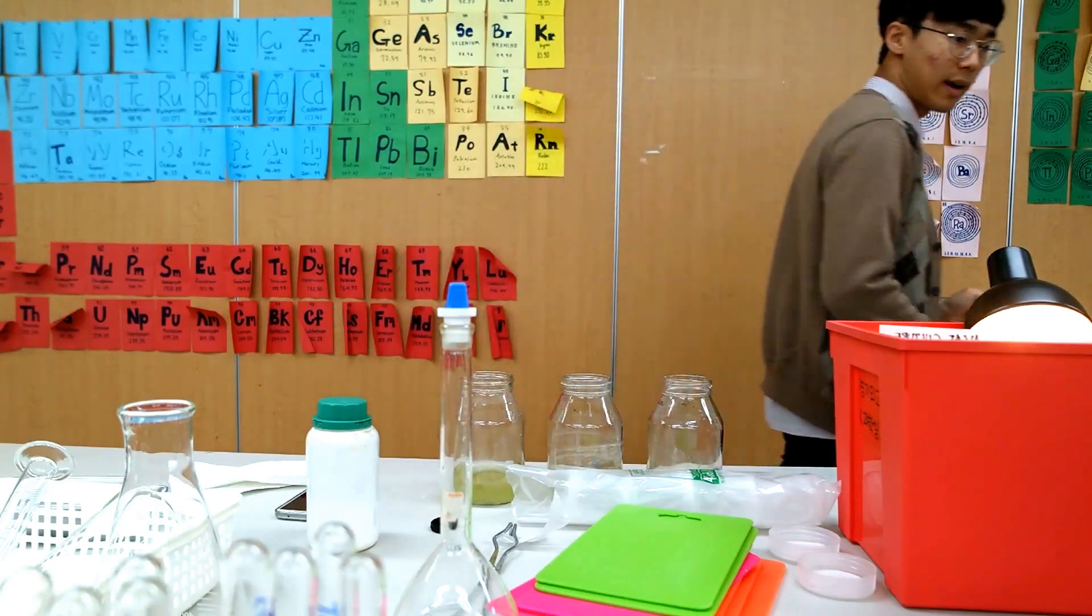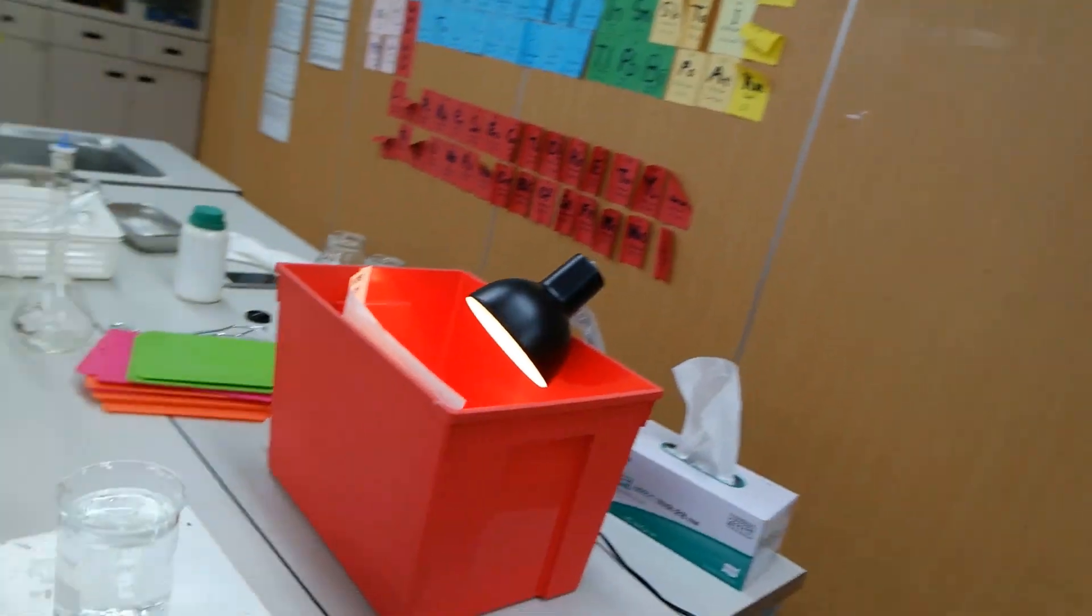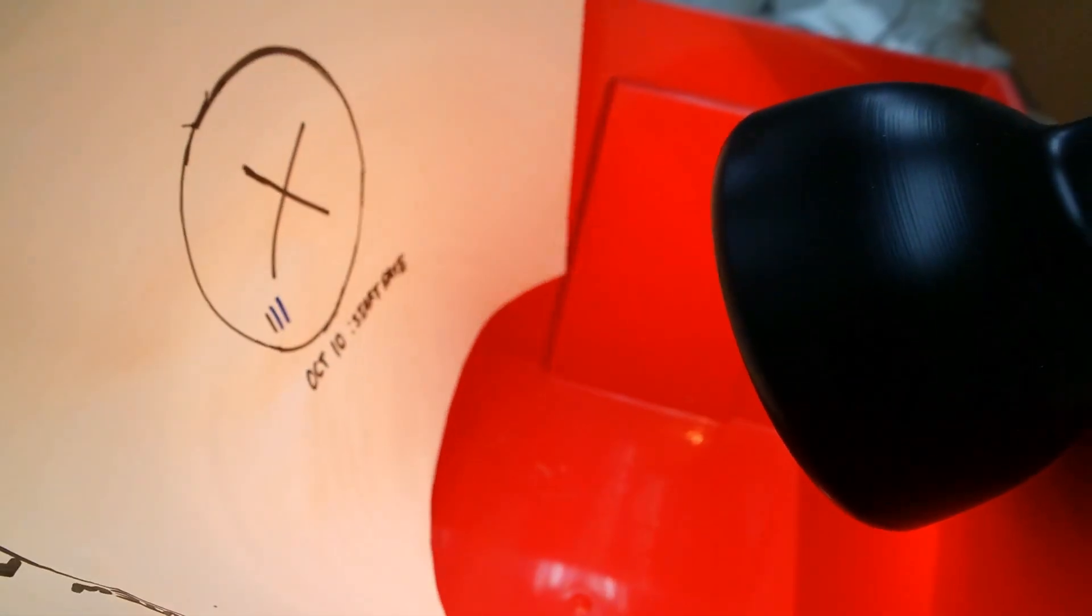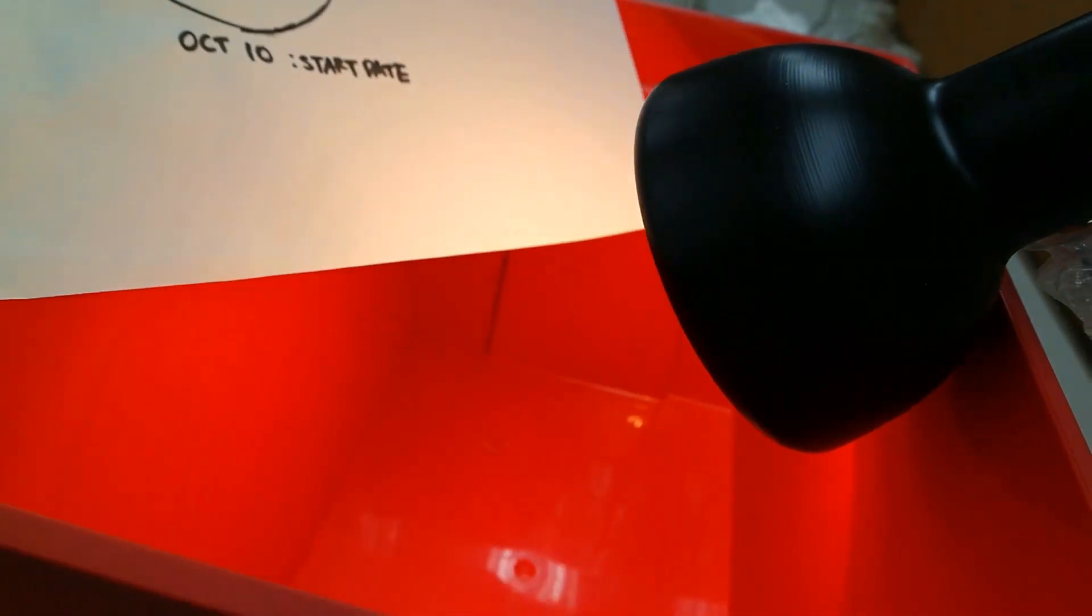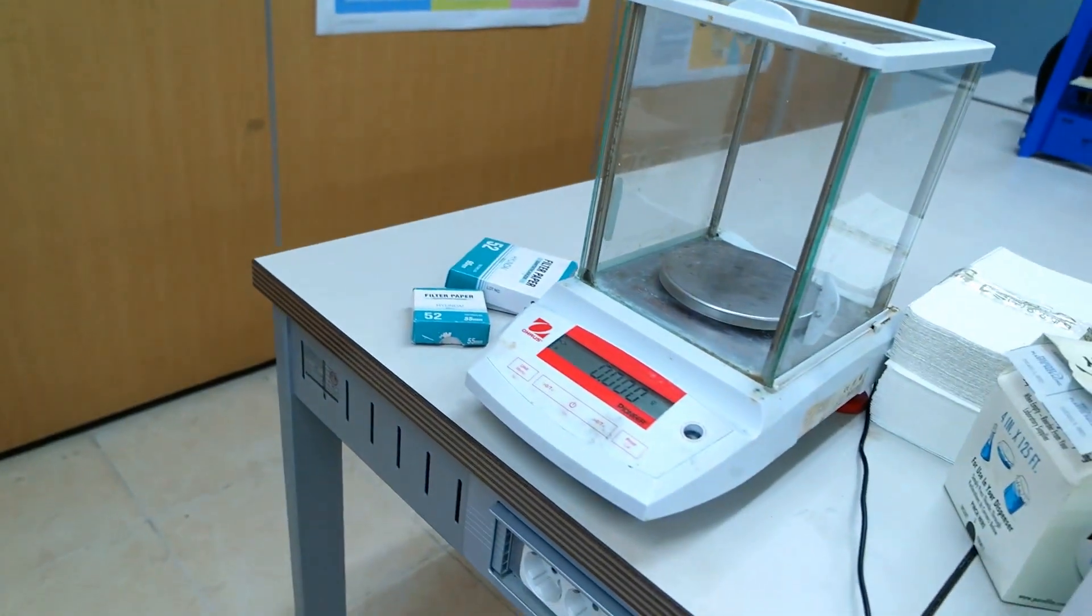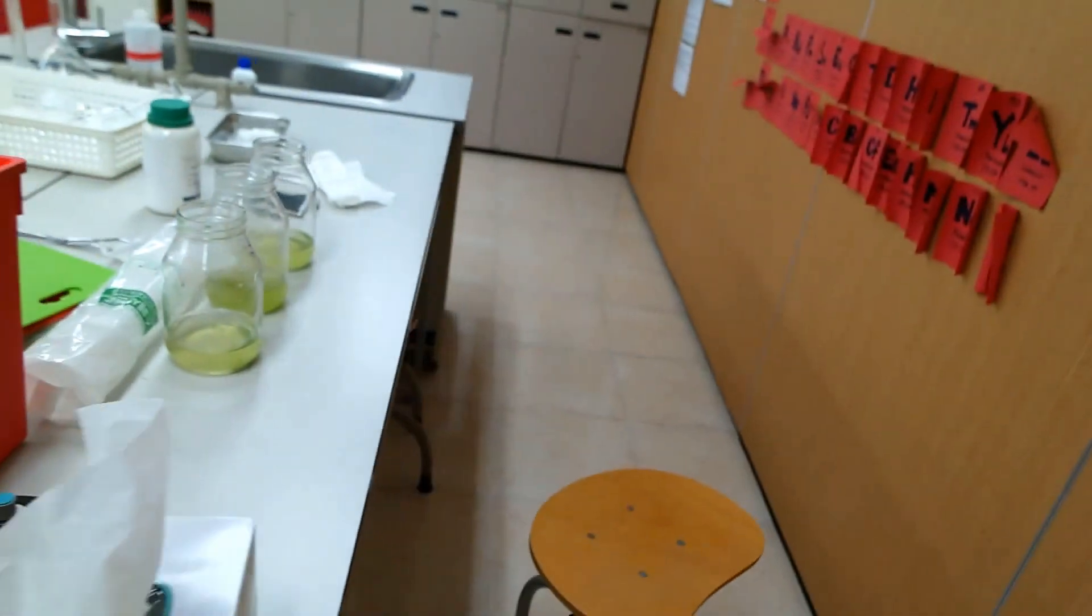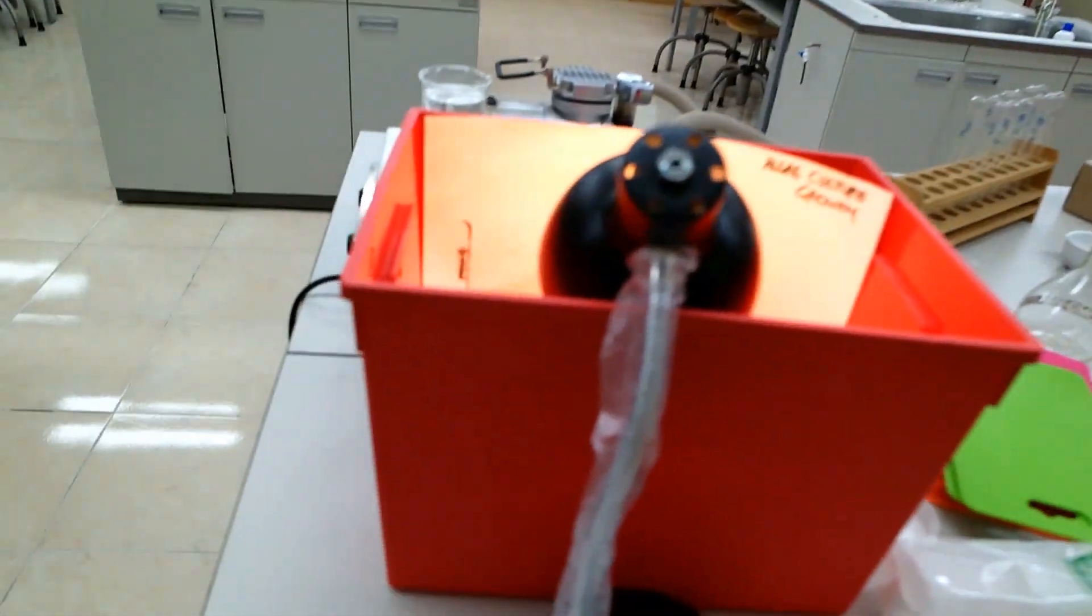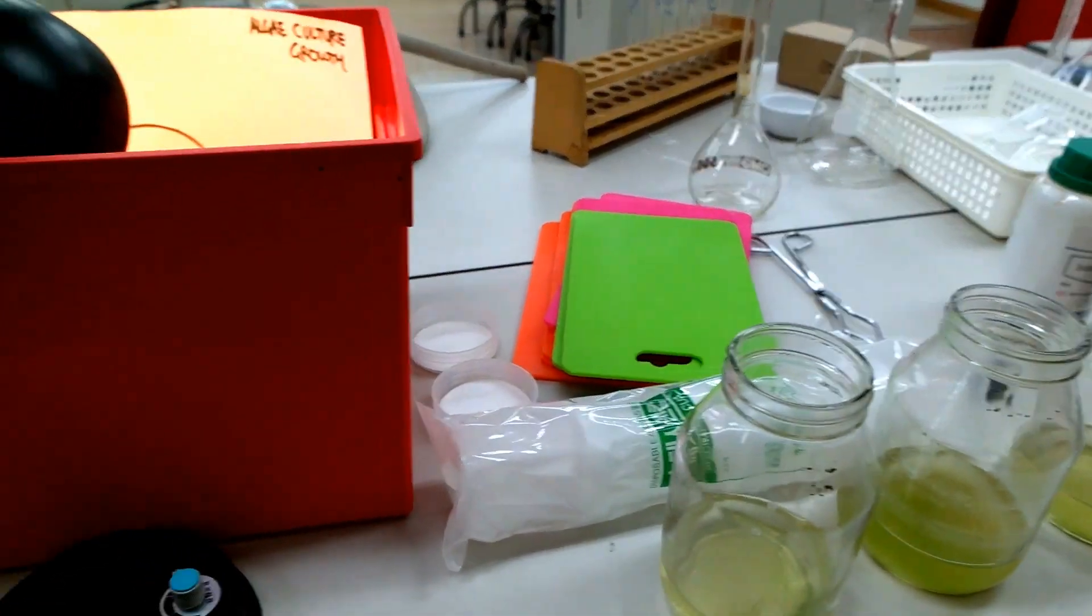This is what I used to measure the growth of algae. I wanted to check the weight, but the weight doesn't work because the jar itself is too heavy for this machine to detect. And also the problem is that since the bottle is open, it's exposed to the atmosphere and the heat of this lamp is evaporating the water. Therefore, the measurement of weight would not be accurate.